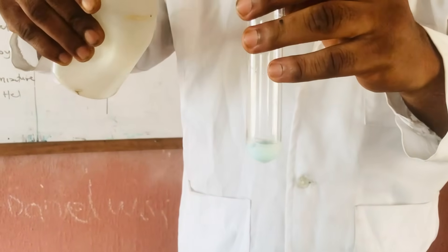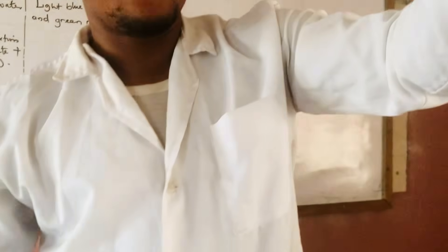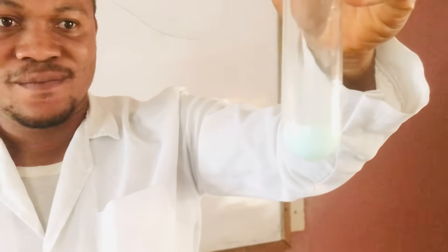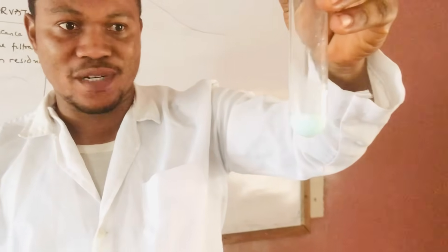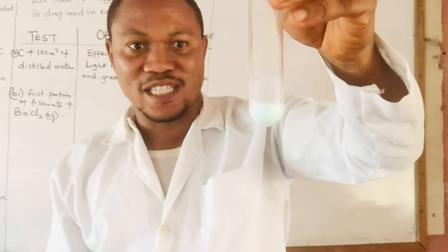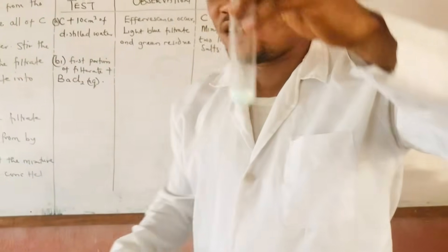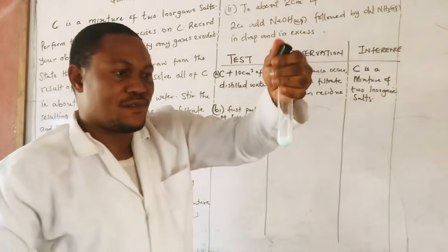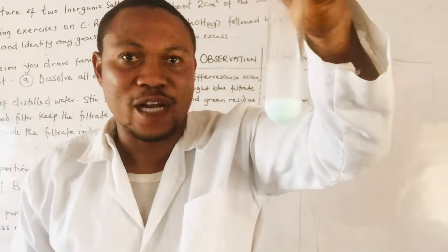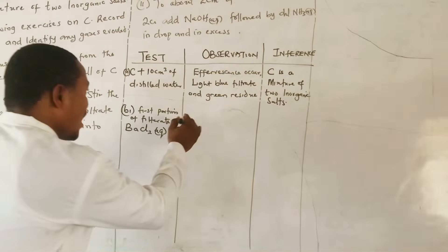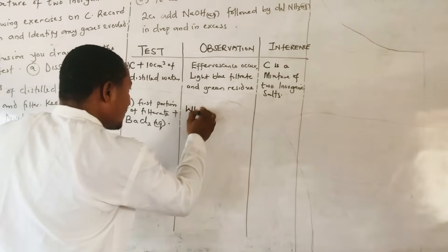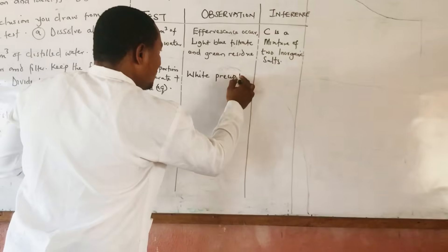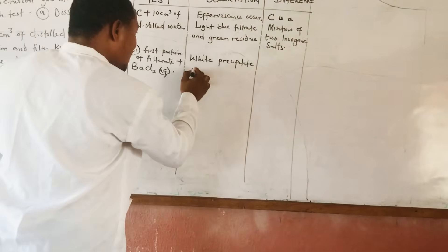Let's see what's going to happen. Look at that — wow! Look at this: a white precipitate is formed. Can you see that? A white precipitate formed. So on addition of barium chloride, the observation is: white precipitate formed.